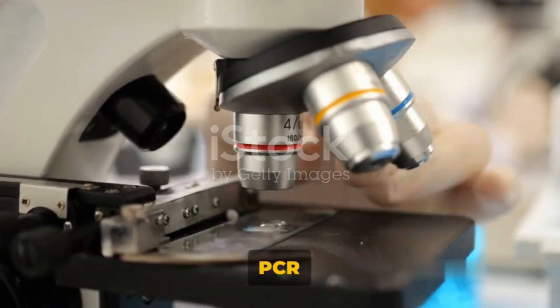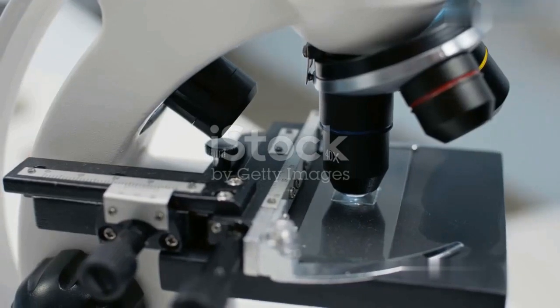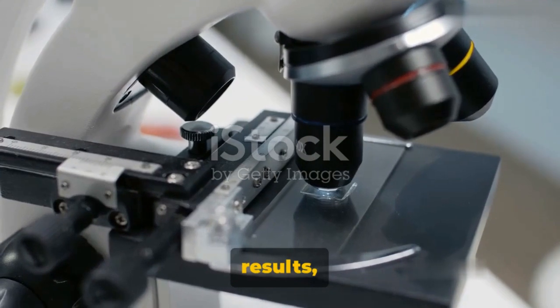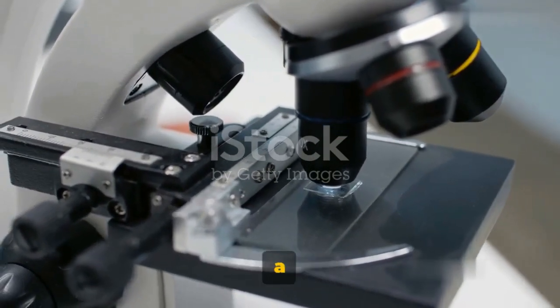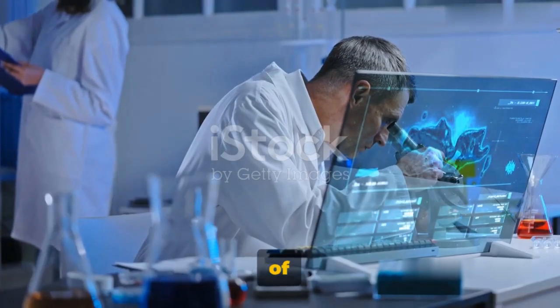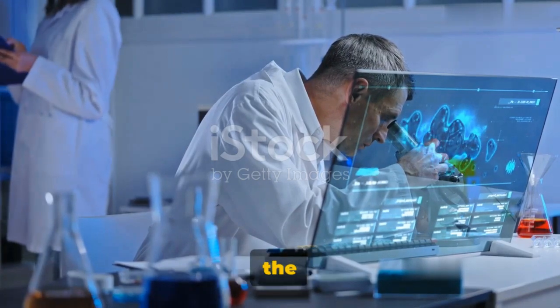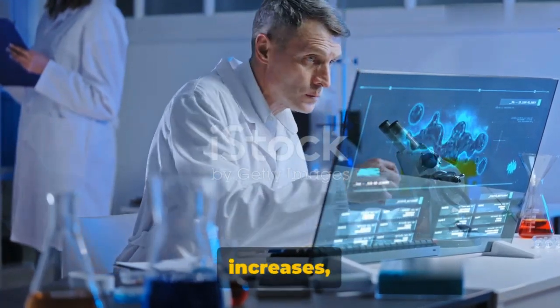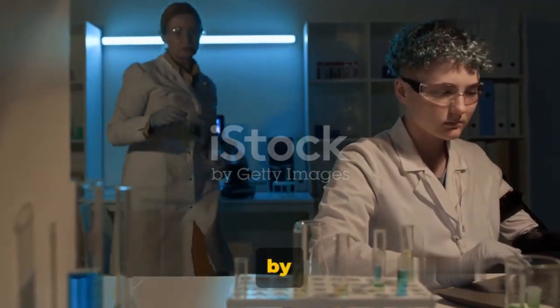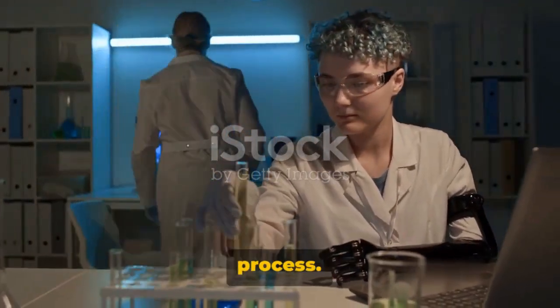The beauty of real-time PCR lies in its ability to monitor this amplification process in real time. Unlike conventional PCR, where you have to wait until the end of the process to analyze the results, real-time PCR provides a continuous reading of the amount of DNA present in the sample. This is achieved by the use of a reporter molecule that emits fluorescence. As the PCR reaction proceeds, the amount of reporter molecule increases, and so does the fluorescence. This fluorescence is detected and measured by the PCR instrument, giving us a real-time reading of the DNA amplification process.